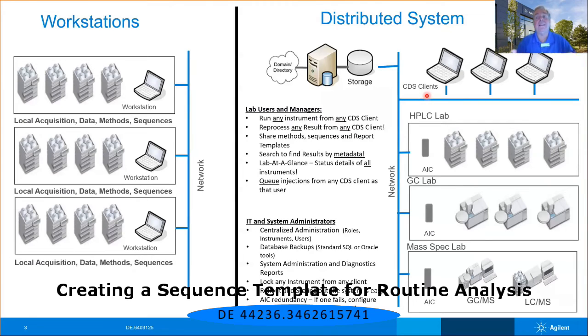One last item that I didn't actually include on this slide. It's actually probably the most important item of all. The one question I am asked more than any other question when I go into a laboratory, and I'll typically get this from lab supervisors or lab managers, is there a way for them, the lab supervisors or managers, to get an offline copy of the program in order to put it on their desktop computers or their laptops so they can not necessarily take up a seat in the laboratory, but be able to do data review and other things in satellite locations? The answer to that question is yes.